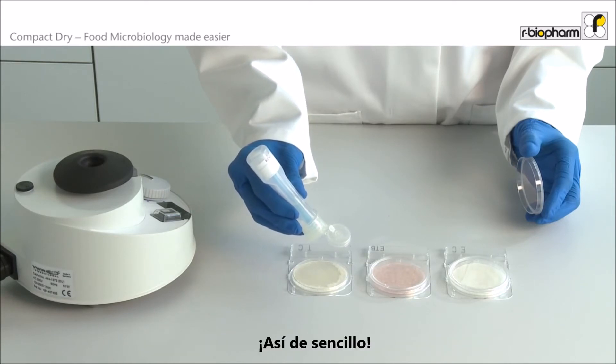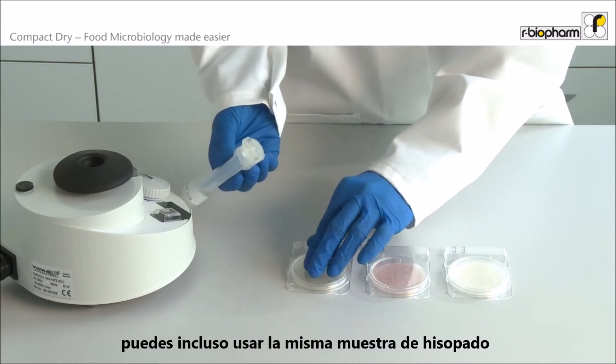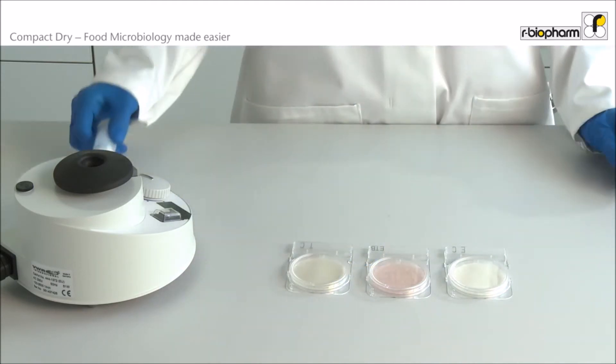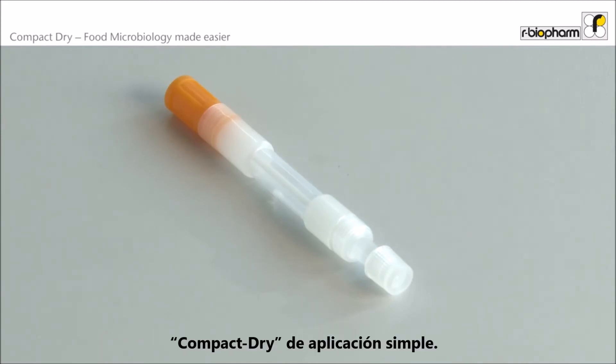And is that easy? When using the ProMedia swabs, you can even use the same swab sample on different Compact Dry plates. For surface monitoring, Compact Dry swabs for single application are also available.